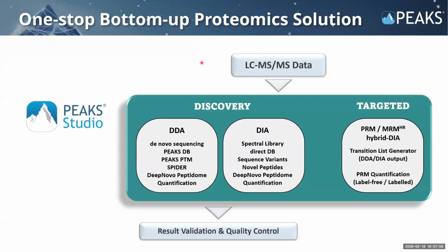Now, I'd like to introduce Peaks and how it supports comprehensive bottom-up proteomic workflows. And actually, Peaks Studio and Peaks Online are really built on the same core algorithmic logic. That means whether you're working on Peaks Online or Peaks Studio, you're using the same high-performance de novo-driven analysis framework.